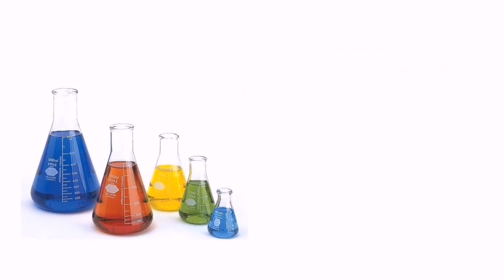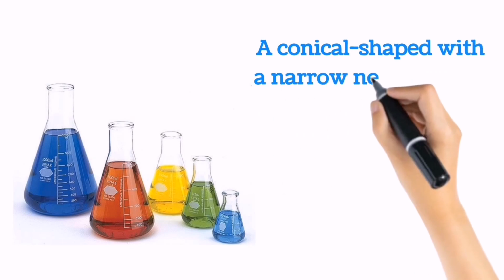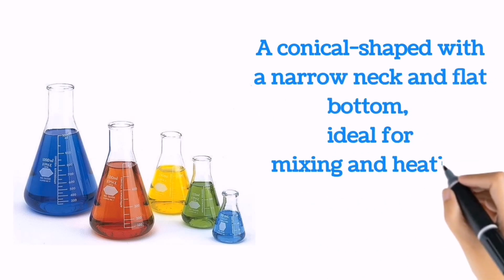Flask, a conical shape with a narrow neck and flat bottom. Ideal for mixing and heating liquids while minimizing splashing.